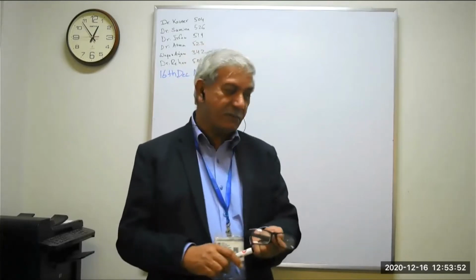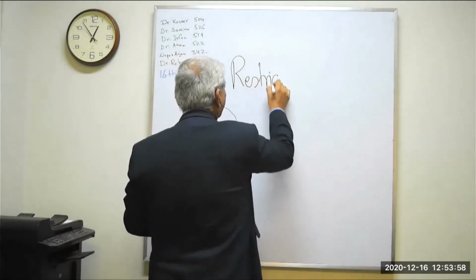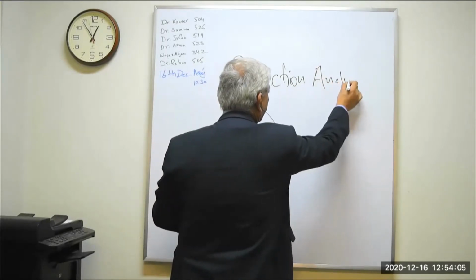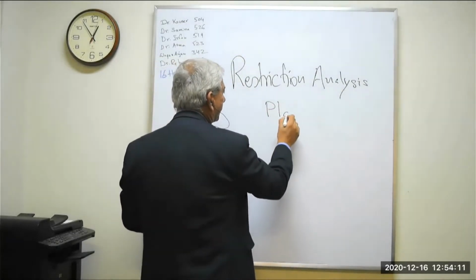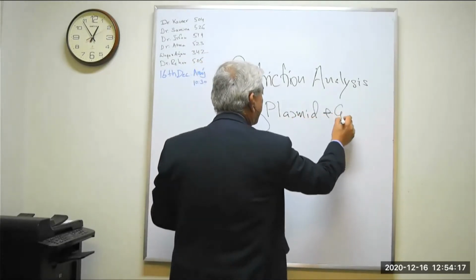So our experiment is restriction analysis of plasmid and genomic DNA.